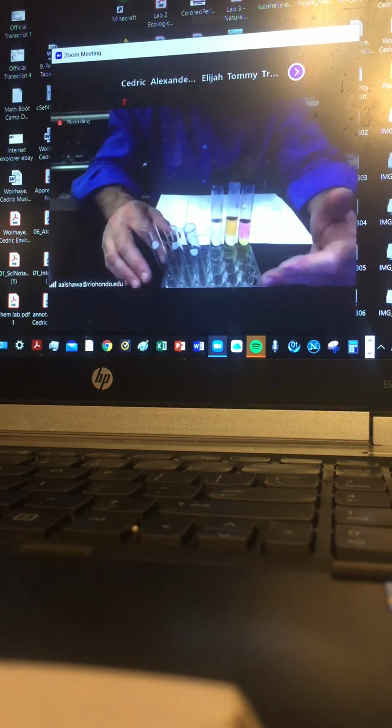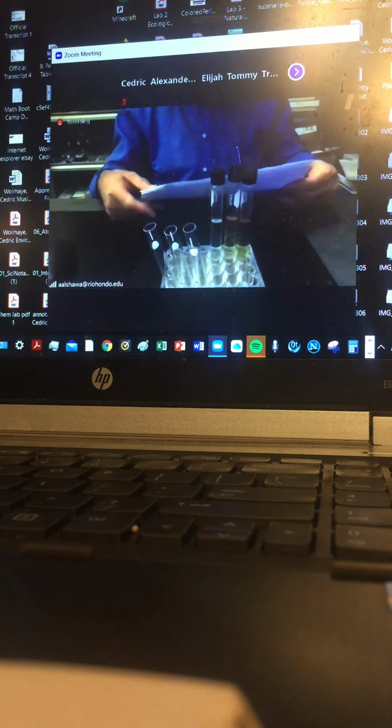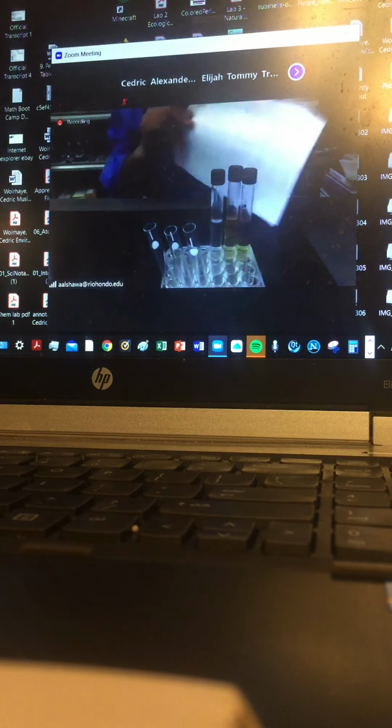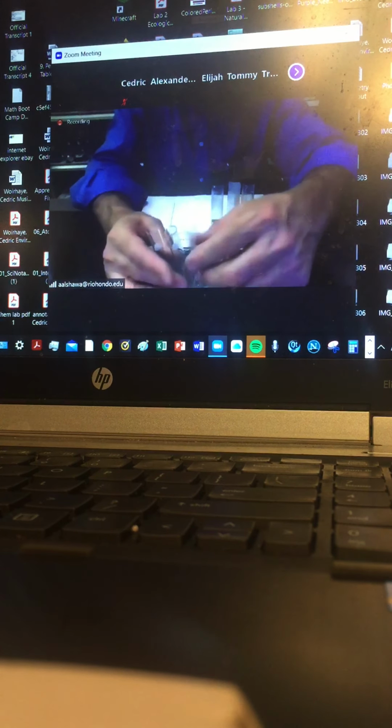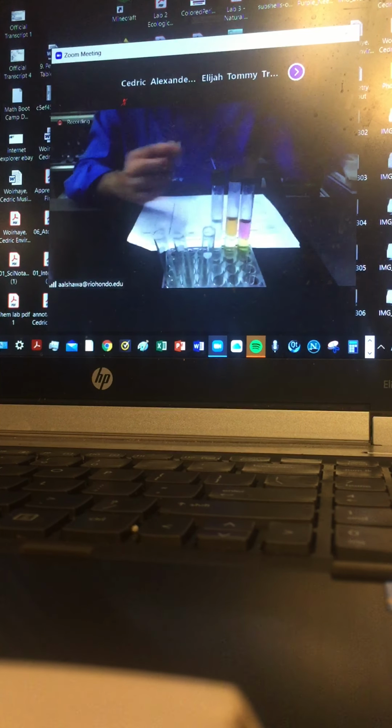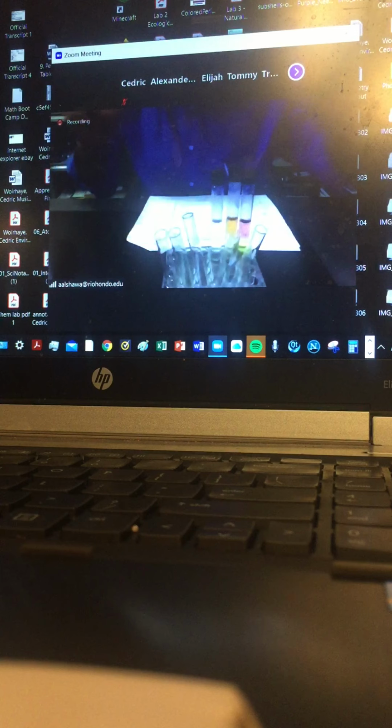You can test it if you want, but I'm trying to avoid wasting more chemicals. It doesn't matter, so I guess we can just add them. Plus, I need more testing, just to see for the heck of it.